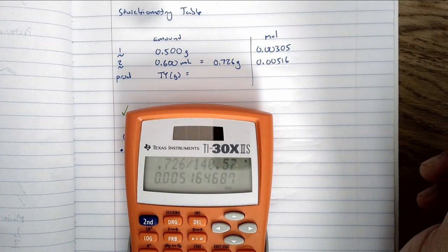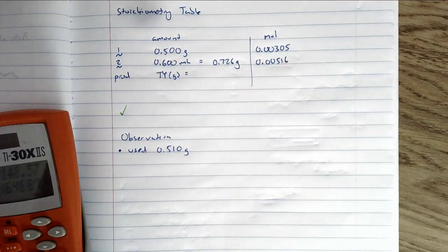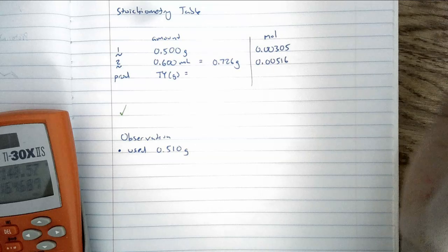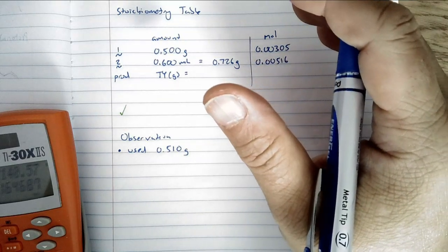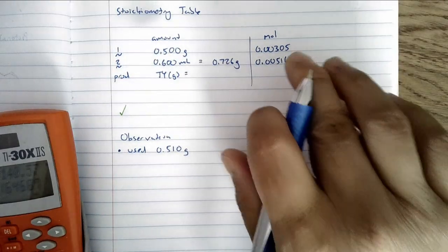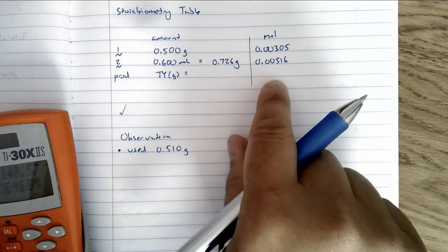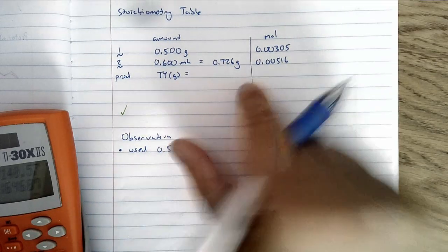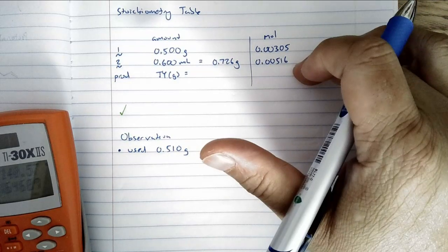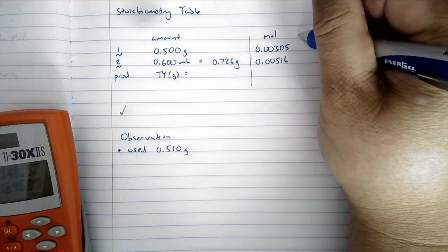I'm trying to remember if this was reasonable. For you, just be careful with the numbers and what it is. Don't try to overthink it. I'm not going to overthink it. I think that's real. Now the moles. I don't know what moles to put for the product because I don't yet know the limiting reagent. That will be a calculation that we'll do together in just a bit.